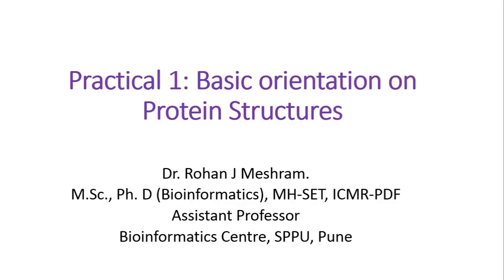So I have designed these set of practicals, or you can say I will demonstrate some interesting facts about proteins, and the objective of designing this set of videos is to orient new users, new biologists, biochemists or even medicinal chemists to understand the structural aspects of biochemistry, to make you aware of what protein structures are and what wonderful things you can learn just by observing the protein structures.